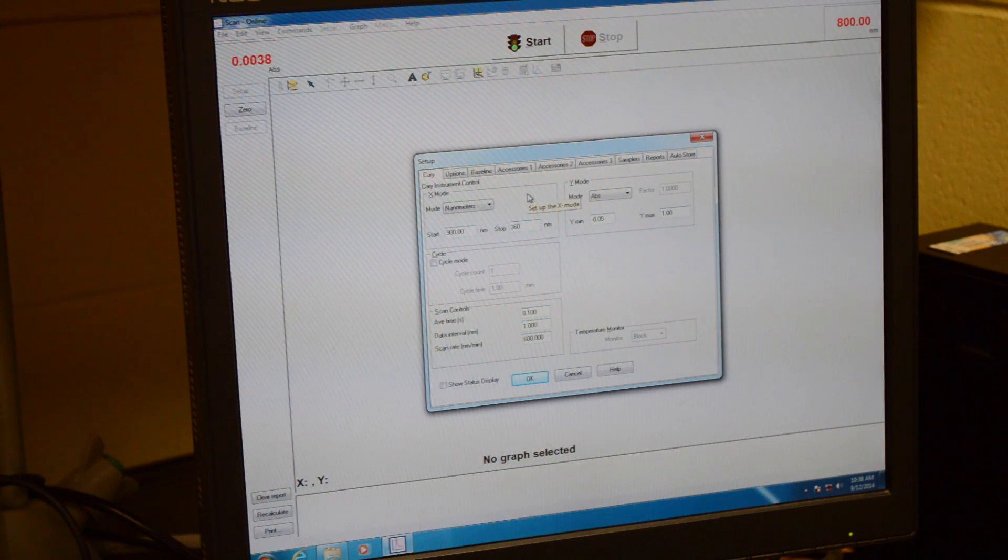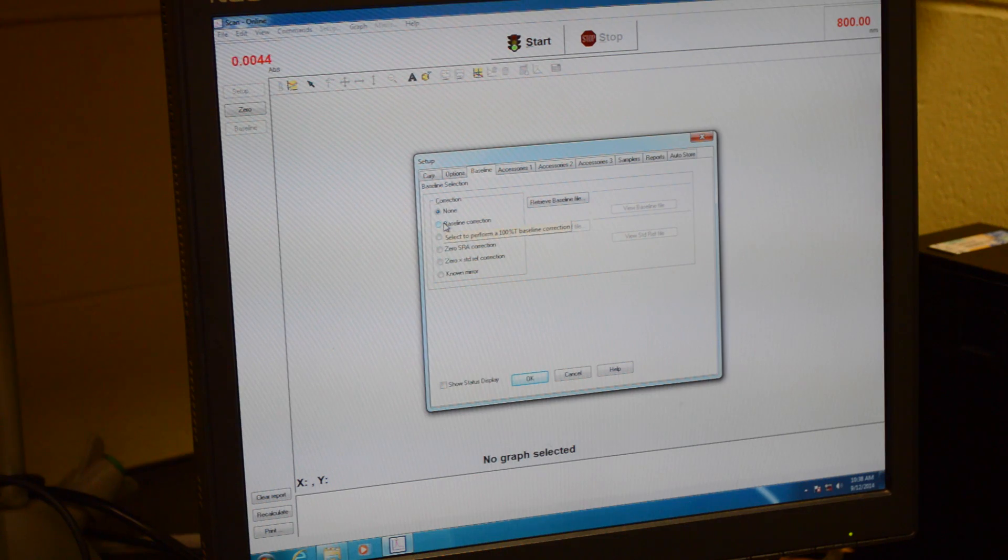The next thing you would do from here is you would go into the baseline tab and click baseline correction and then you're just going to press OK from there.